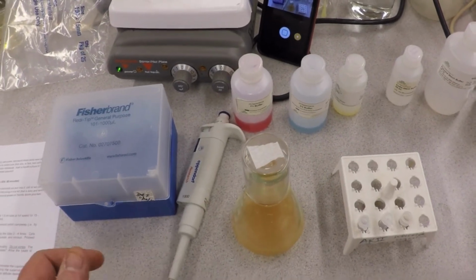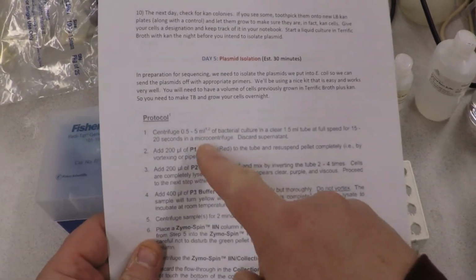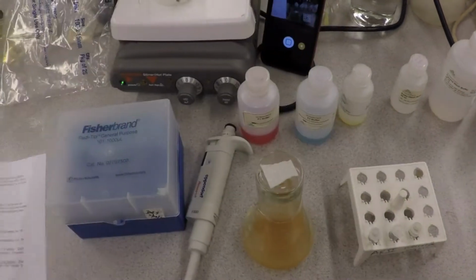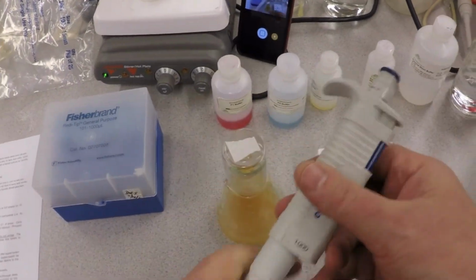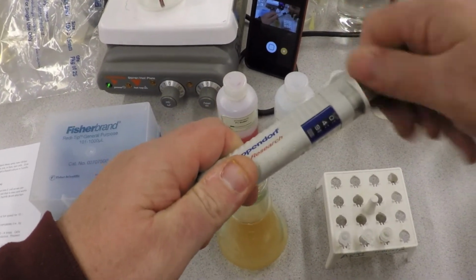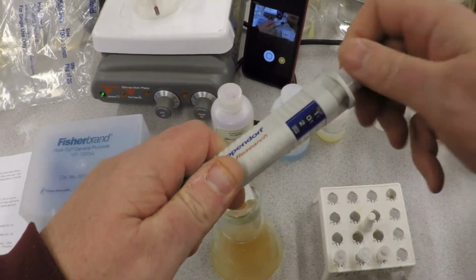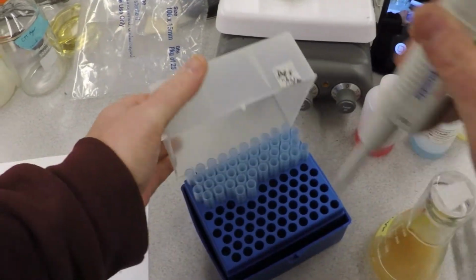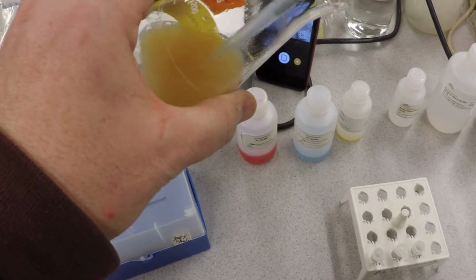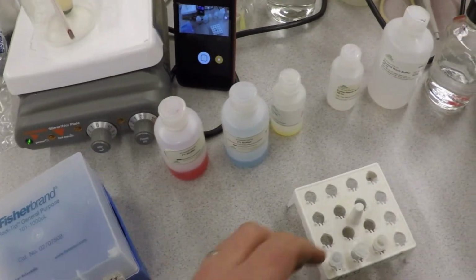So, first things first. When you read the directions, it says centrifuge bacterial cells, 15 to 20 seconds at high speed. So what you need to do is take out, I would take out a full milliliter myself of your cells and spin them. Take out your little cells, carefully pipette them out, put them in an Eppendorf tube.